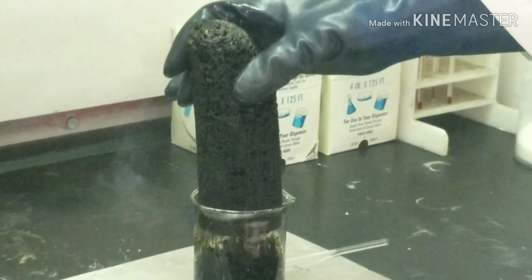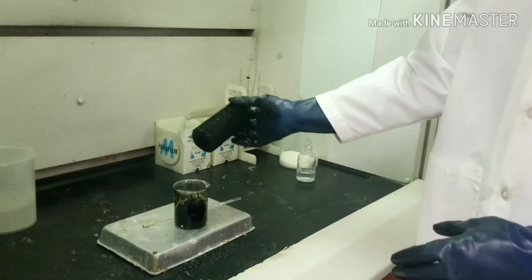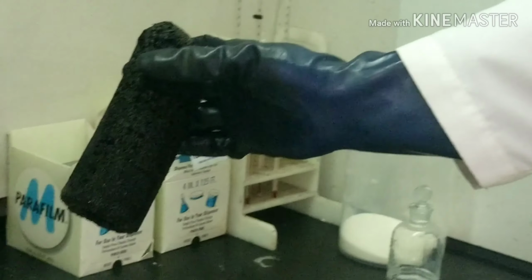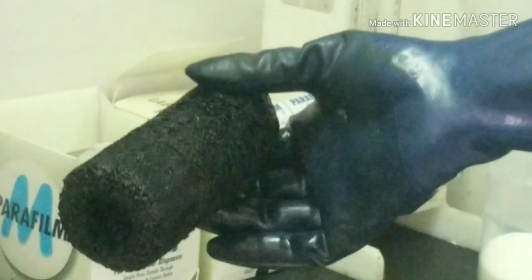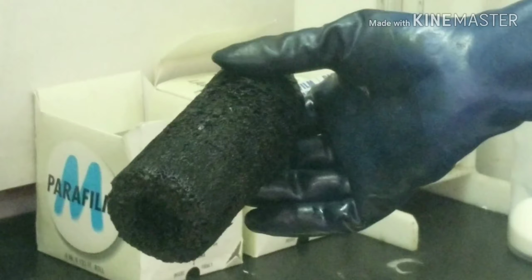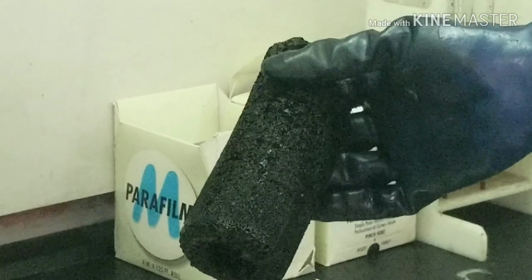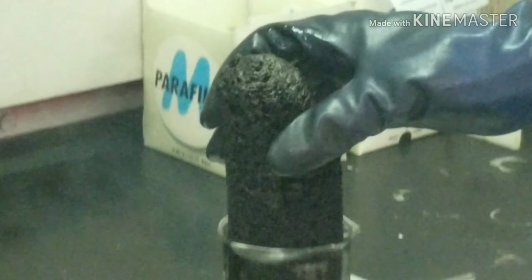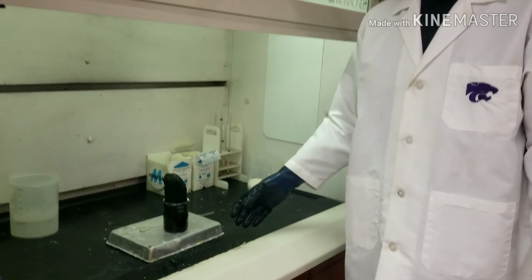Take this and pull it out a little bit. Again, pretty crumbly, pretty low density. But this is carbon. This is that carbon part of the product. We have water vapor, you can see as well. So put that back down. I hope you enjoyed this little demonstration. We're going to do one more here.